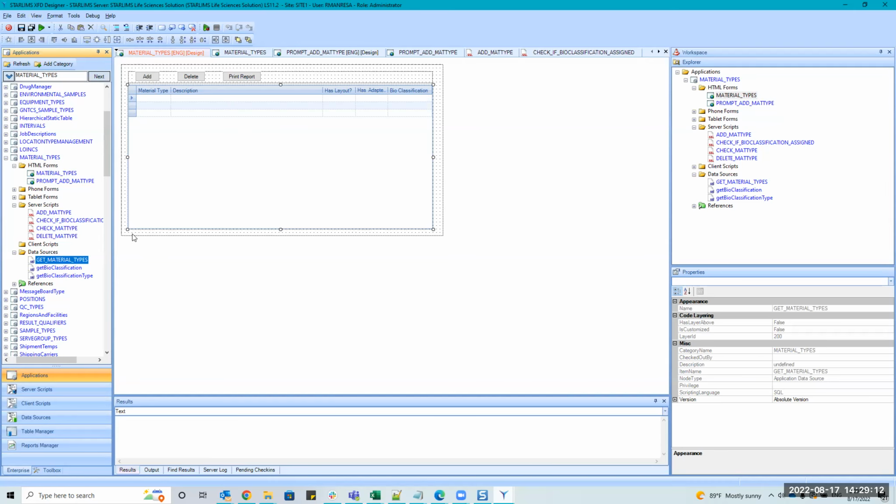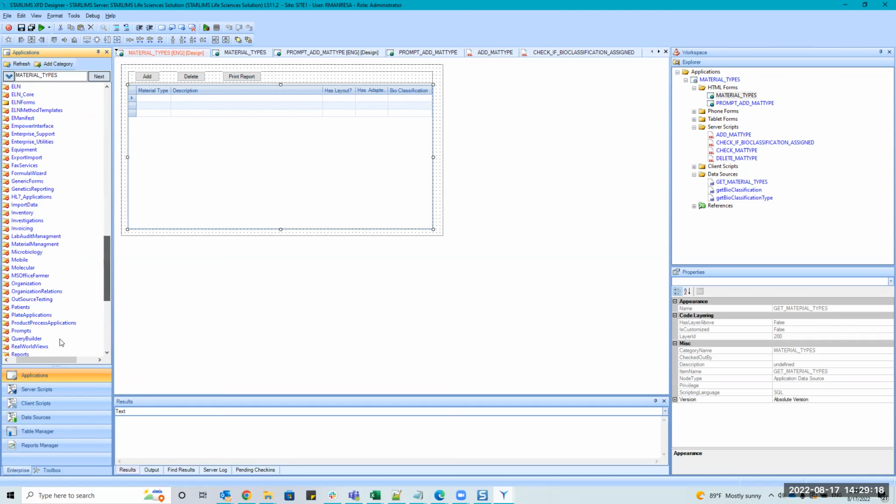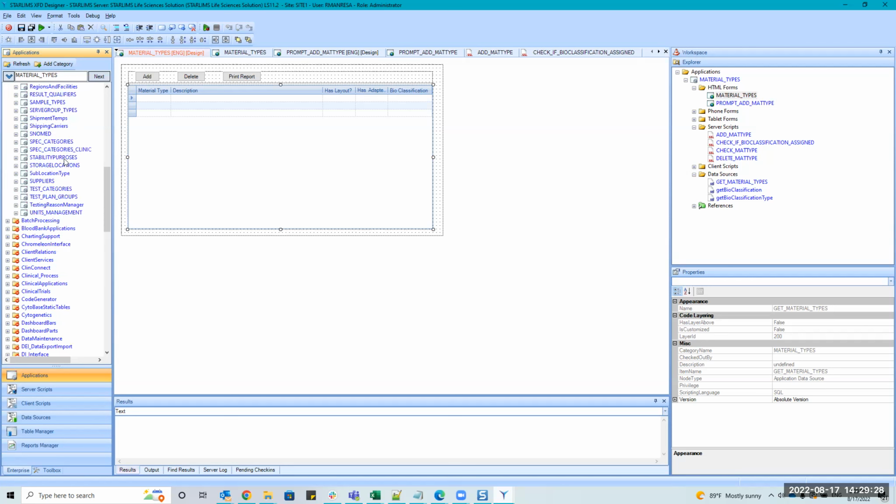And where I was getting with all of this is, we have the tool, we have the designer, we have everything you could ever want to do some self-learning, right? Because like I mentioned, right now we're going to teach you a little bit, but there's just so much. So hopefully we can use the designer to do a lot of what we need to.